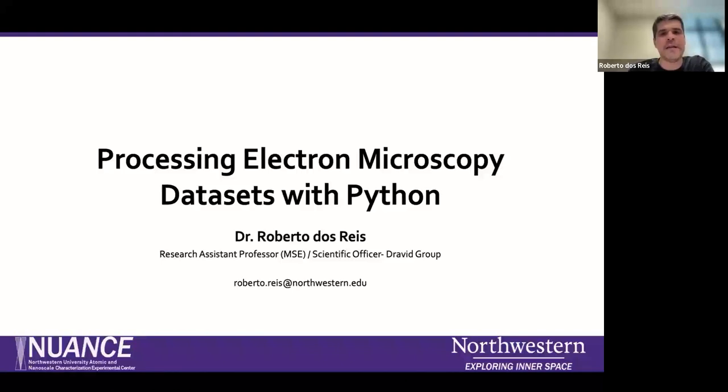So the idea here is just to give you some tools to process some of the data that you acquire with SEMs or TEMs. This is the focus of this tech talk.